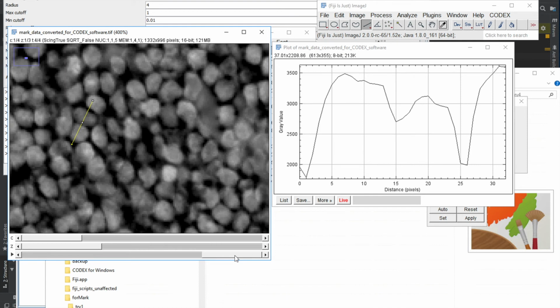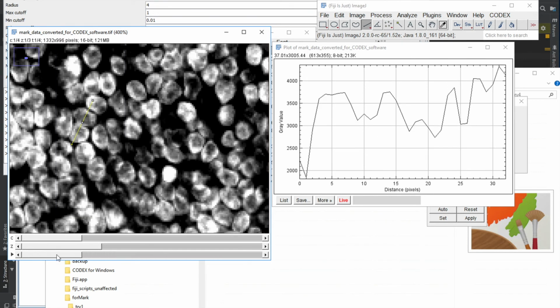Well, we could try to run a segmentation based on this frame as well. Okay, so that's basically the algorithm. You should find optimal parameters to create your segmentation frame, and then optimal parameters to do your segmentation. And indeed, as seen here, subtracting membrane signal definitely helps.